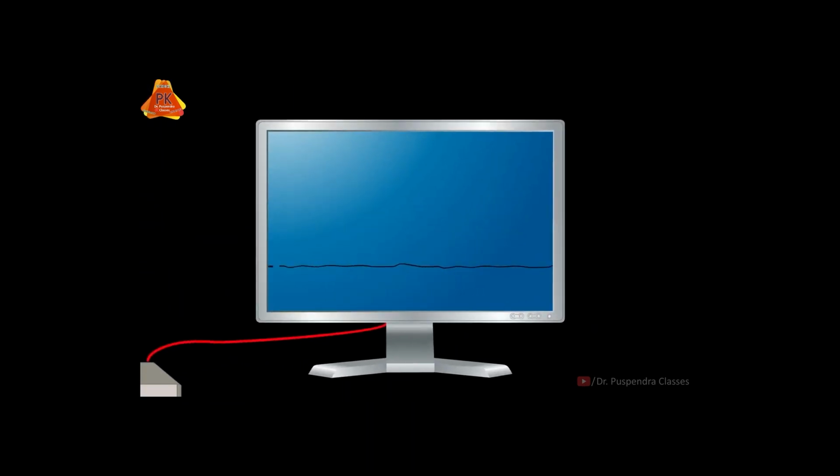Compounds having least affinity with the stationary phase will reach the detector first, which is indicated by blue color. Then moderate affinity compound will reach the detector, which is indicated by red color. And finally, highest affinity compound will reach the detector at the end, which is indicated by green color. Ultimately, all signals will appear in the recorder.